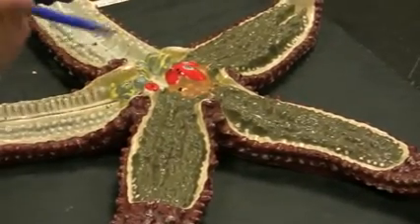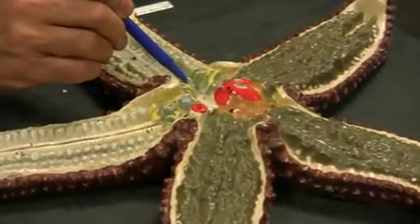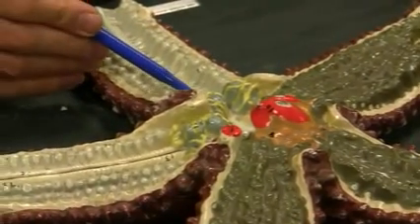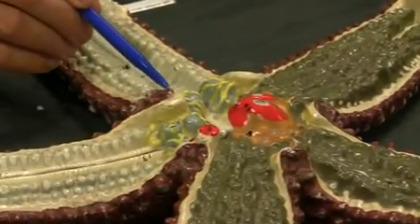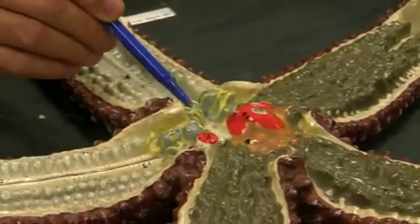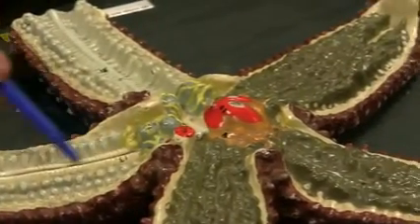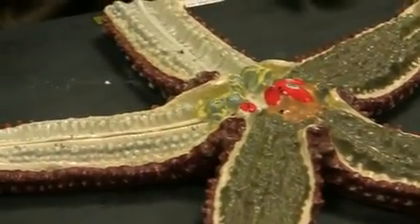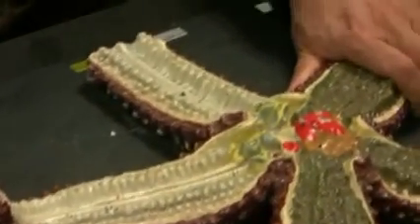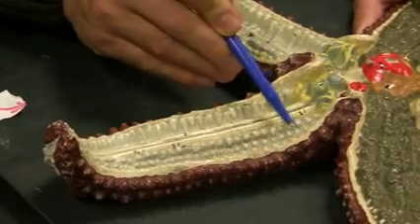Madreporite. The big, huge ones would be Polian vesicles, and the yellow ones would be Tiedemann bodies. I will talk about them in lecture. Tiedemann bodies, Polian vesicles. Ambulacral ridge, ampulla, and that's all I can see in here. The cross section is horrible. That's it. Can you show the ambulacral ridge again? Ambulacral ridge.